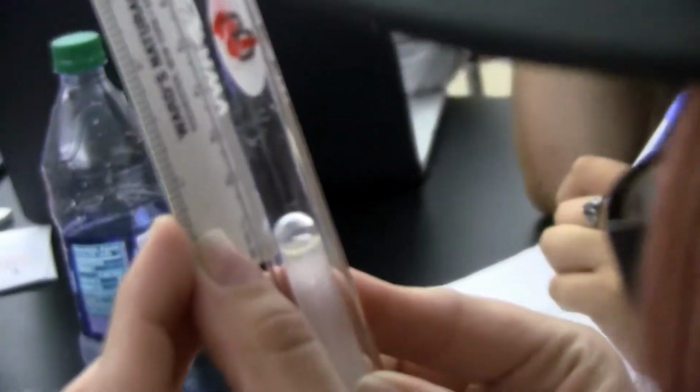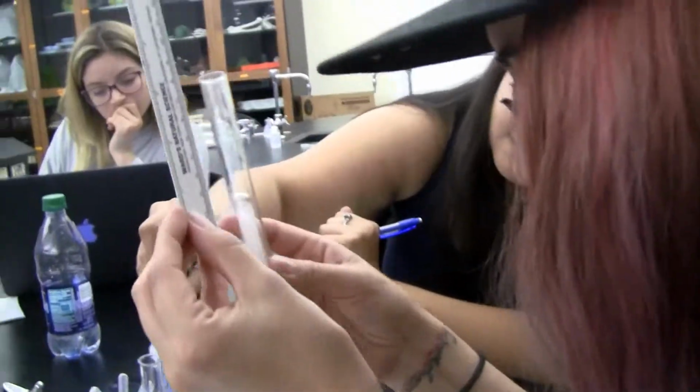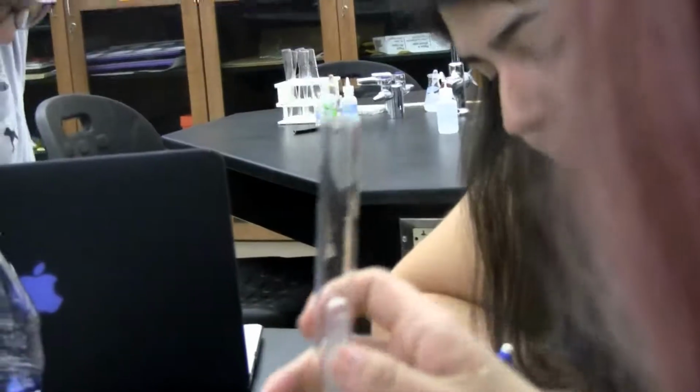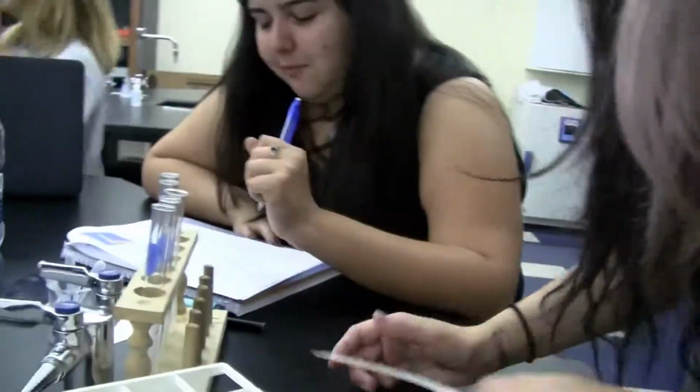Okay, what is this? This is the sucrose one. 3, 4, 5, 6. 6. Okay. That one doubled. It's looking pretty good. That one actually has a lot more than glucose does. 1, 2, 3, 4, 5, 6. 6. Is that the last one? Yeah, this is the distilled water. 1, 2, 3, 4, 5, 6, 7. 7. Did not change at all. Yeah, so that would be our negative control.